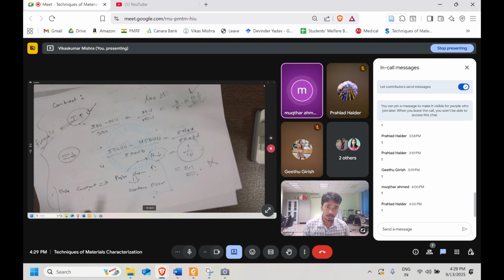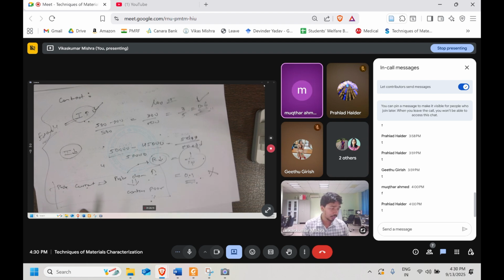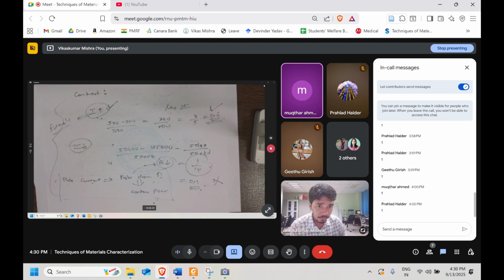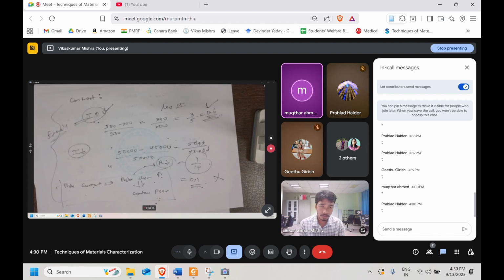It's wonderful to understand the current and the contrast. Really good. In the same way, I would like to understand the magnification and the resolution. I think it's opposite, we need to compromise on either one. When we are increasing to the highest magnification, definitely the resolution will not be reached as we expected. So when we decide we need that resolution, we need to stay with some extent of magnification.